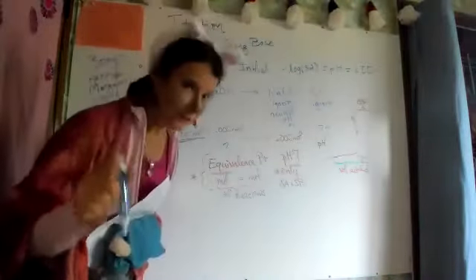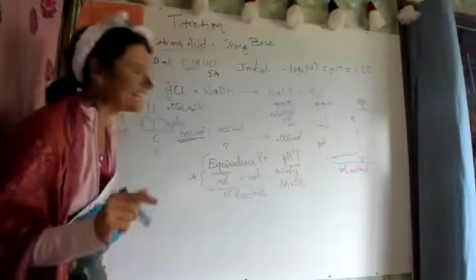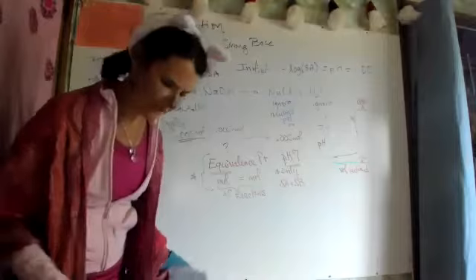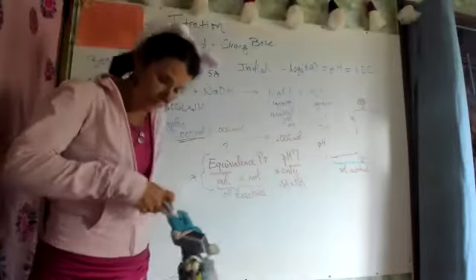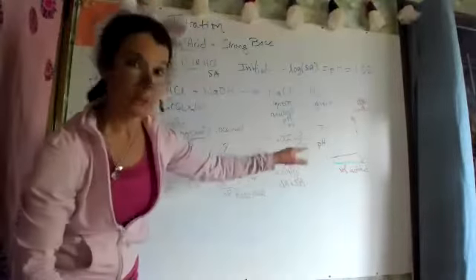One drop. You guys who did titration, try to remember back, that one drop. Actually, I bought this outfit for today, and then we don't have school. But you're going for a perfect pink, and that is the equivalence point.